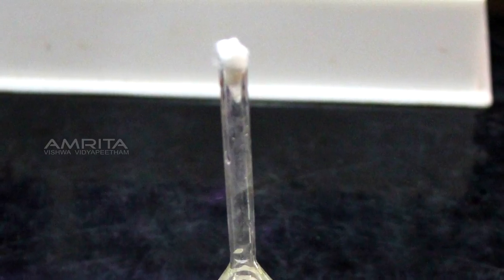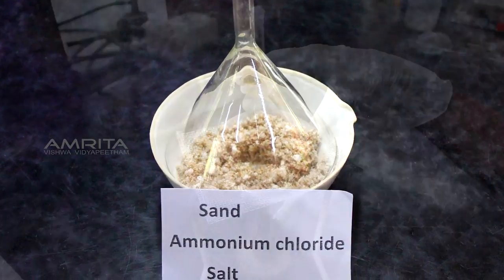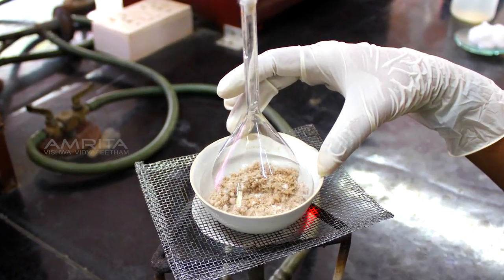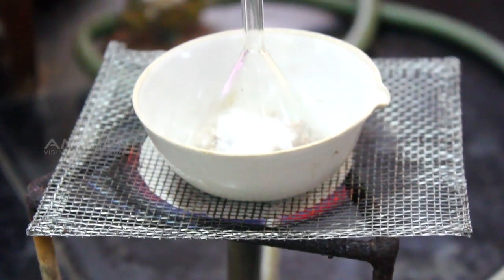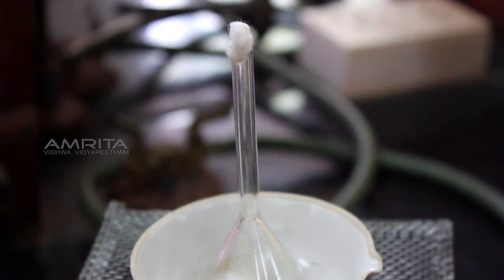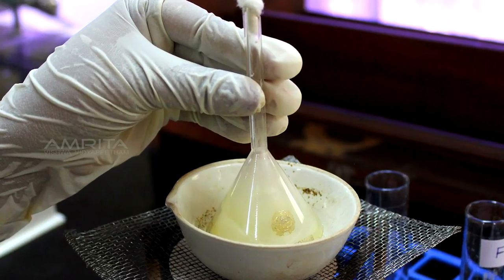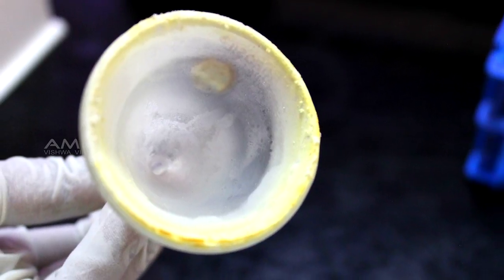Plug the base of a funnel with a cotton ball and cover the china dish with it. Place the china dish over a Bunsen burner and heat the mixture. On heating, white fumes evolve from the china dish and rise in the funnel. When the fumes stop rising, remove the funnel from the china dish and allow it to cool.